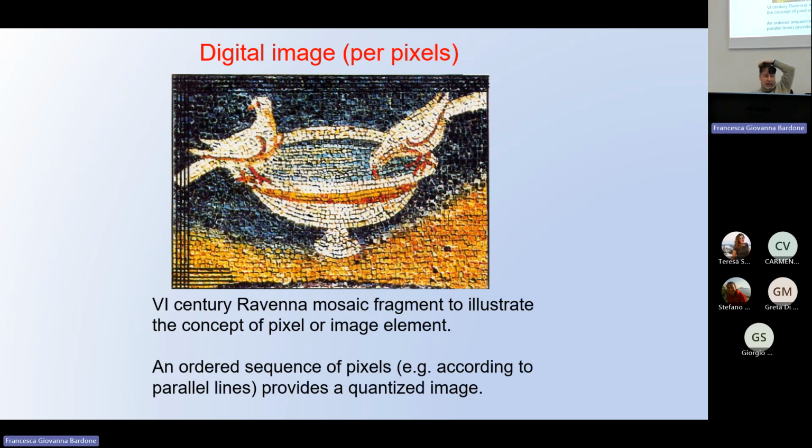When I talk about scanning, what does scanning mean? Why is the name a scanning microscope and not only a microscope? The optical microscope you use every day does not use any scanning at all. You have a parallel illumination, and your objective lens takes in parallel all the photons which come out from the specimen.